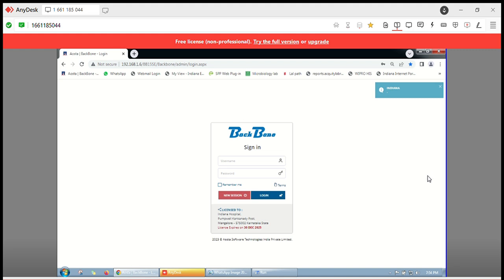Welcome technicians. Today we look into how to receive the sample from IP, that is from NICU, PICU, from emergency department, from OT and all the wards together.